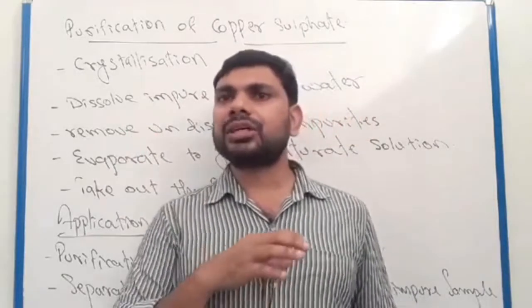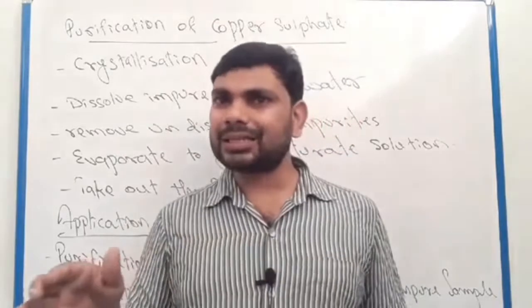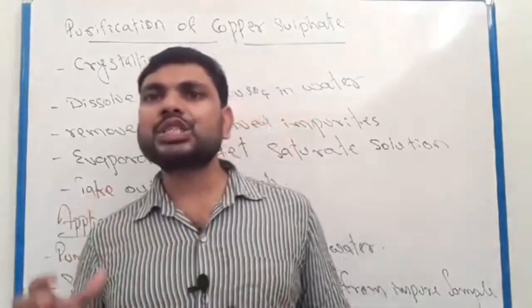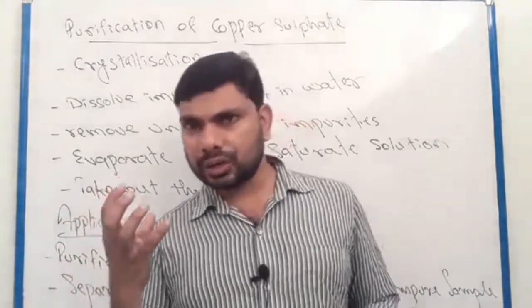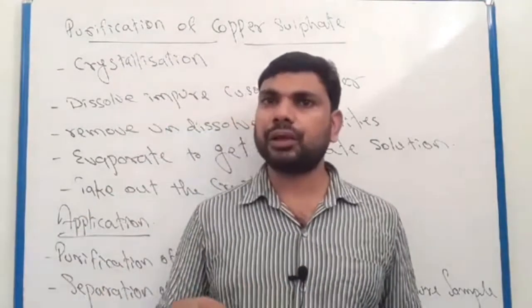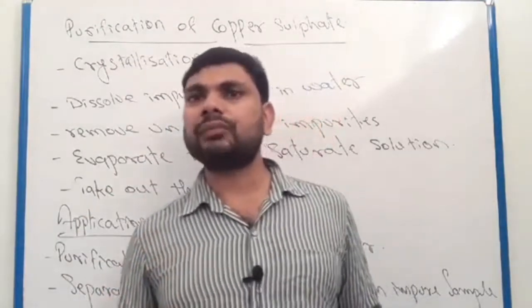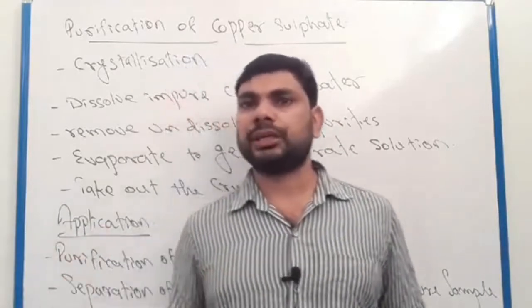Copper sulfate will be dissolved in the water. Remove undissolved impurities by filtration.